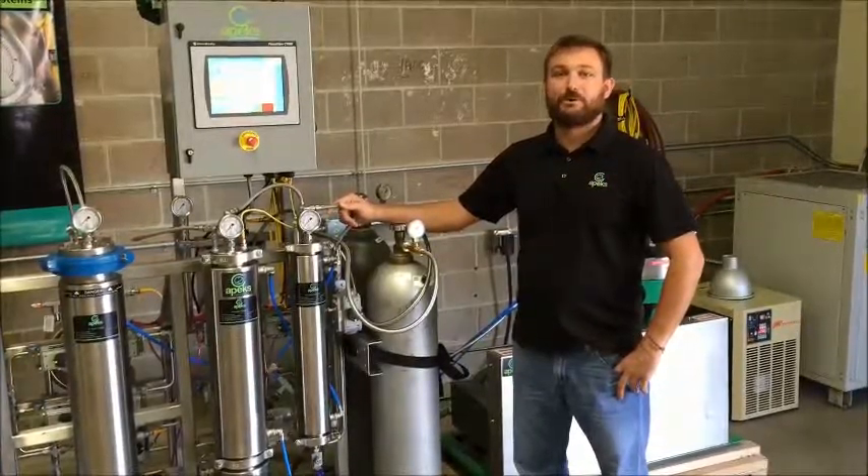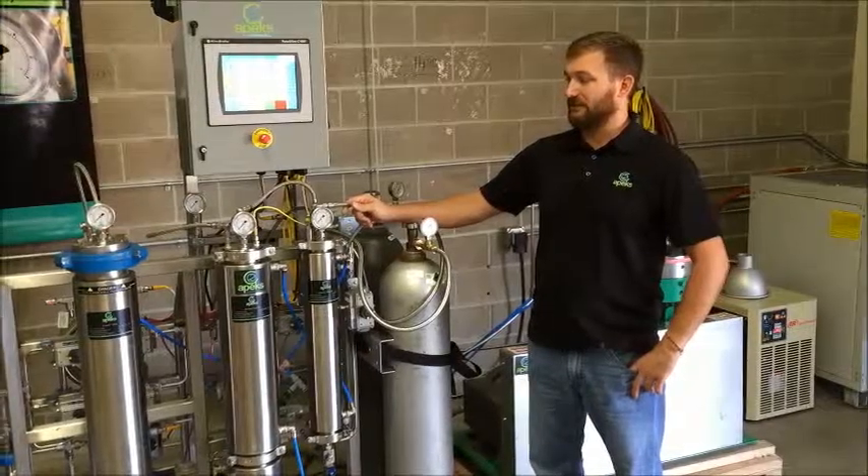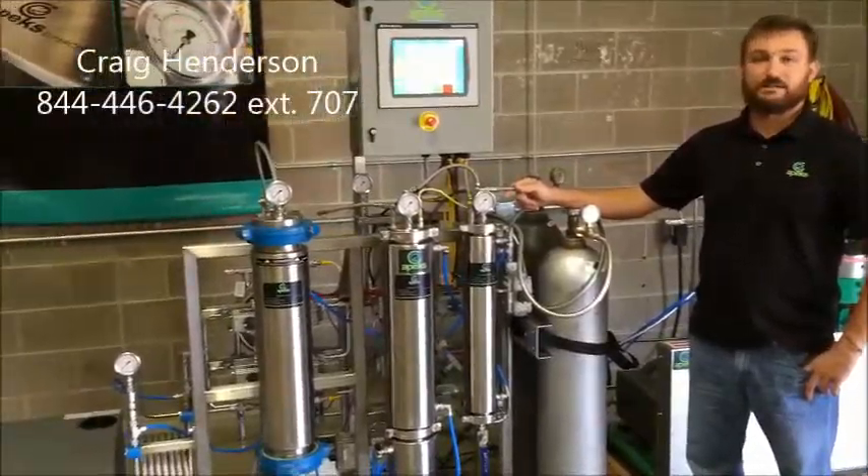My name is Craig Henderson here at Apeks Supercritical. Today we're going to talk about a demonstration on our 2000-5LD series extraction systems.